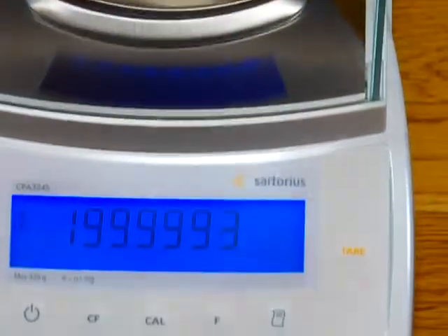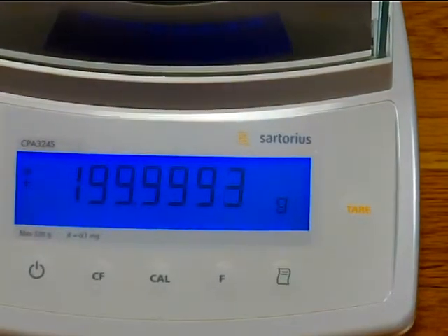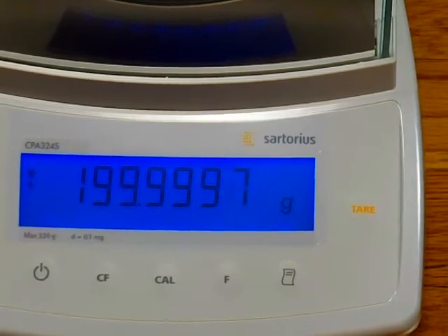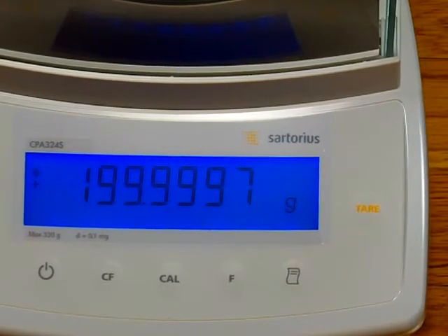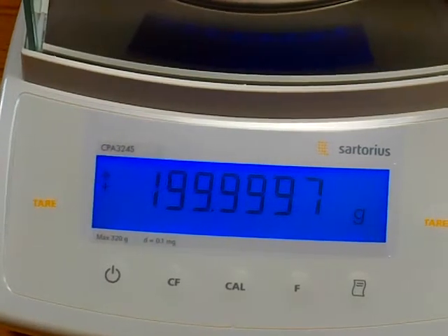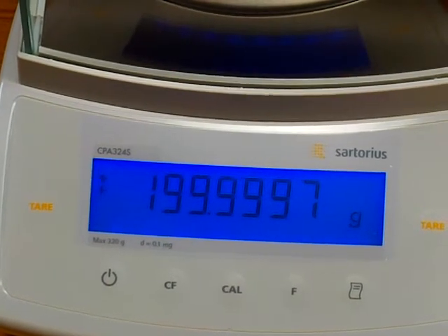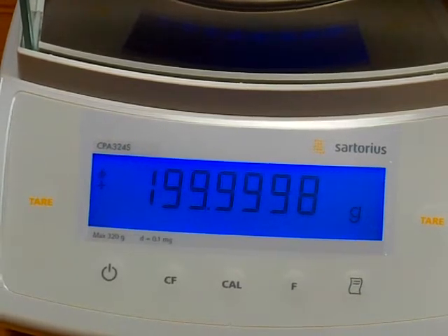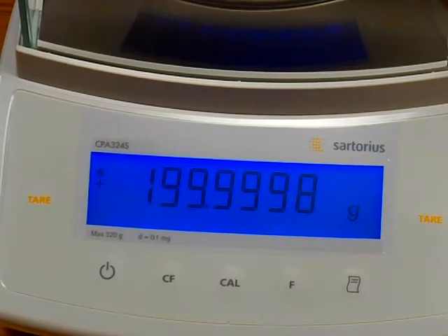Sartorius holds the Guinness World Record for the most accurate balance in the world. They've been building balances longer than anyone else. Again, with our 200-gram weight, the balance is showing 199.9998 and probably in a second we'll get it to 199.9999.